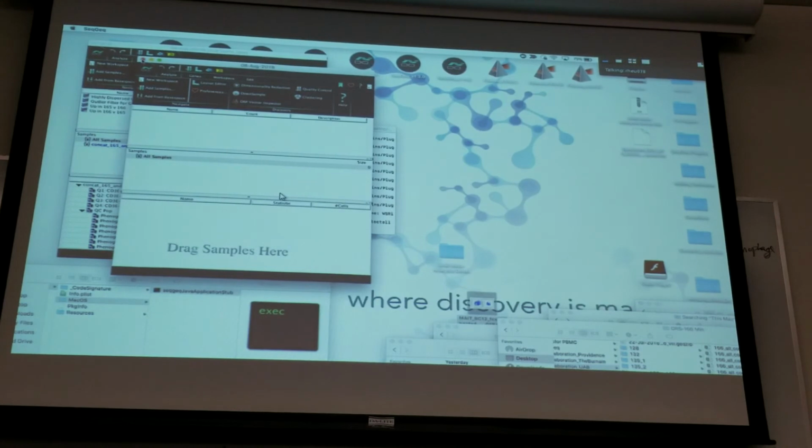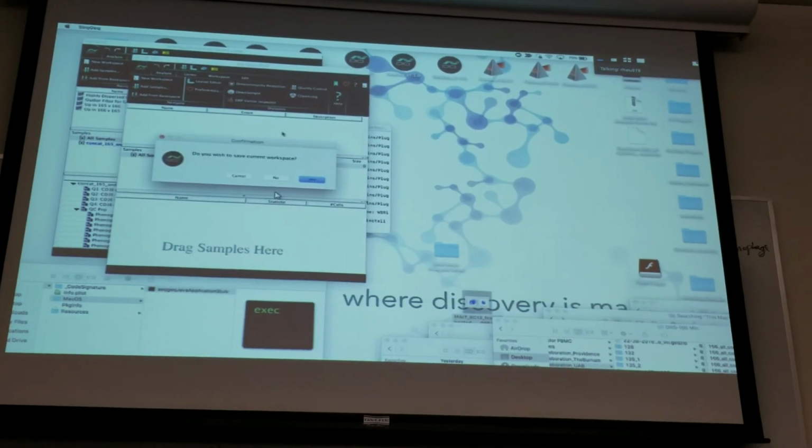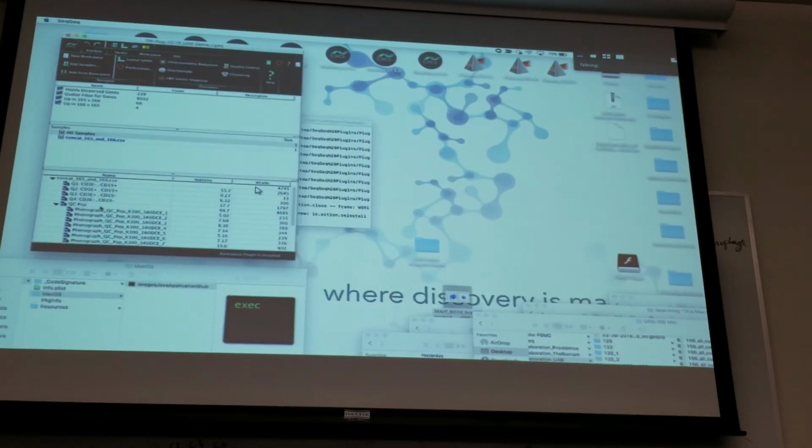I mean, are you defining it based on CDR3, or is it more of a heavy chain, light chain pairing? Yeah, it's a heavy chain, light chain pairing. We can also look at the CDR3 here in the VDJ plugin. Let me show you. I think it'll become clearer once you open up that plugin.